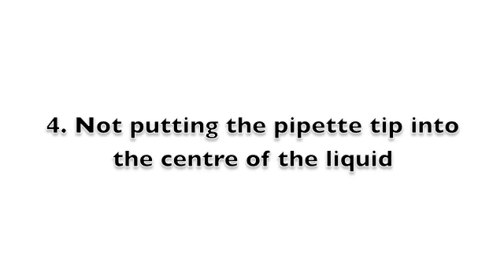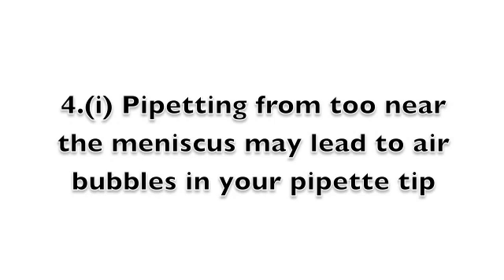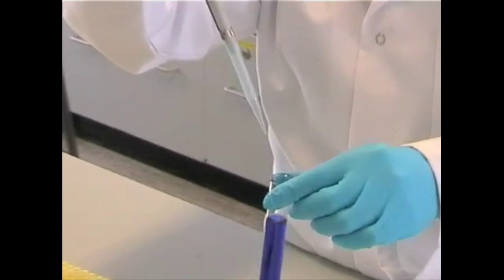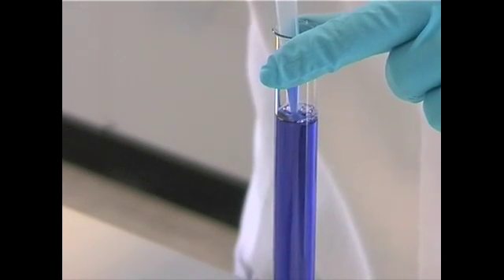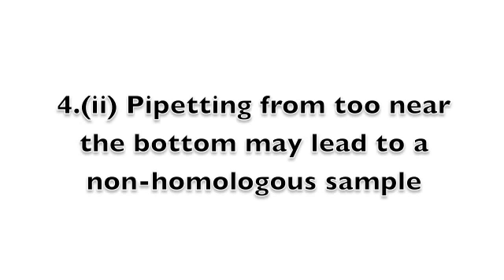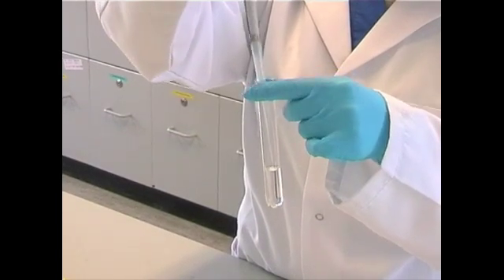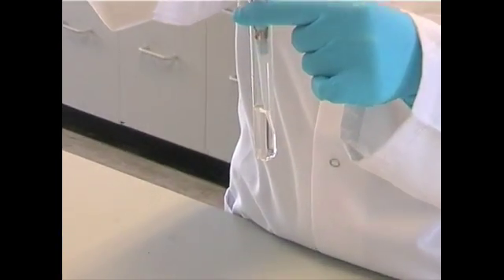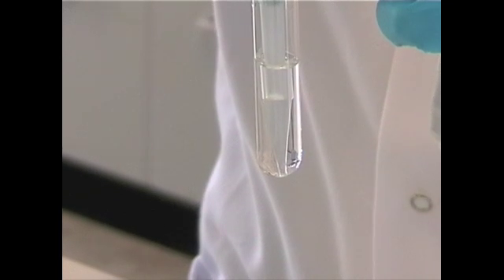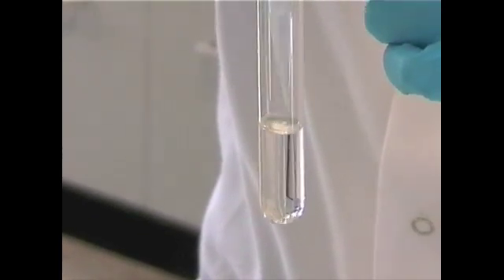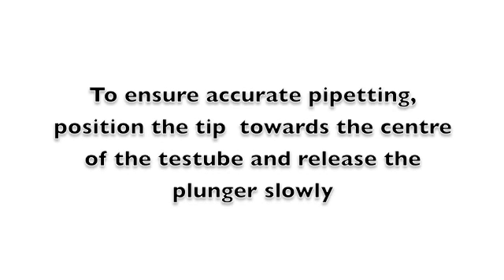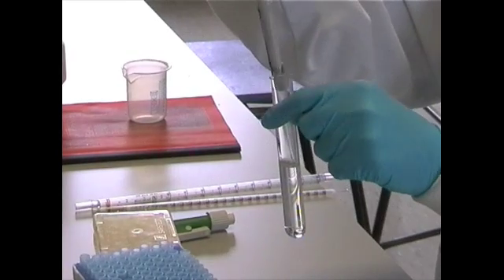Not putting the pipette tip into the centre of the liquid may result in errors in pipetting. Specifically, pipetting from too near the meniscus may lead to air bubbles in your pipette tip, as shown here. While pipetting from too near the bottom of your test tube may lead to a non-homogenous sample. To ensure accurate pipetting, position the tip towards the centre of the test tube and release the plunger slowly.